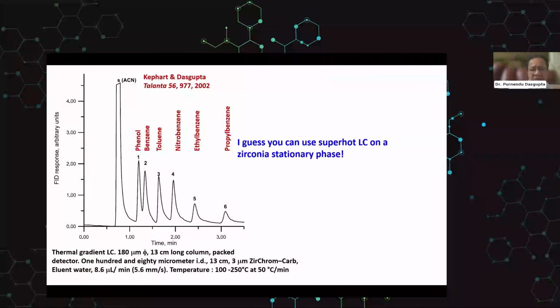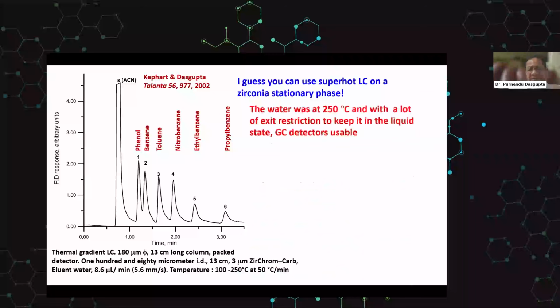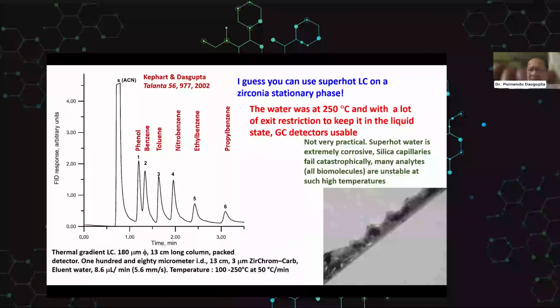Water is extremely corrosive at high temperatures. And this is what happens even after saturating it with silica. A silica column basically is eaten in a few hours. It literally dissolves.